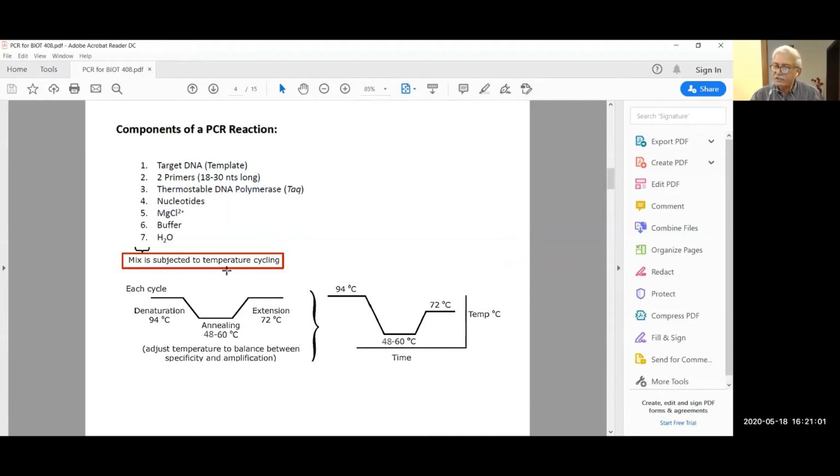Now I will state here one more thing, that while you are performing a PCR reaction, you are mixing a number of ingredients, and after that you need to mix them. Okay, this is highly essential. What about in PCR? Do you really need to mix them? Mixing can introduce some bubbles. It can cause some oxidations. There's no doubt about it.